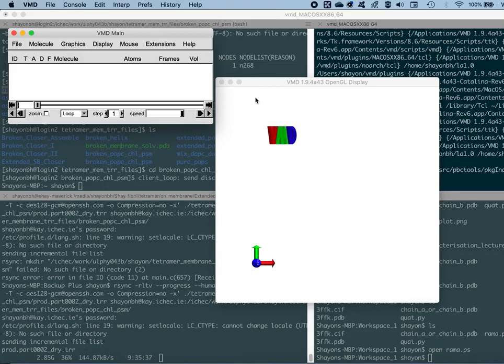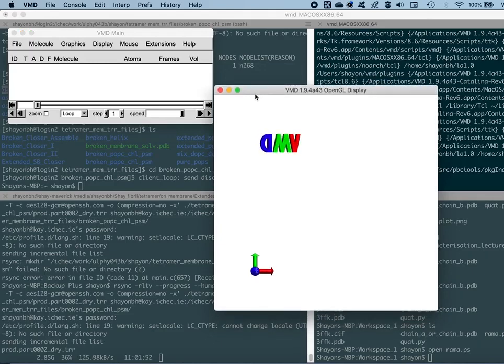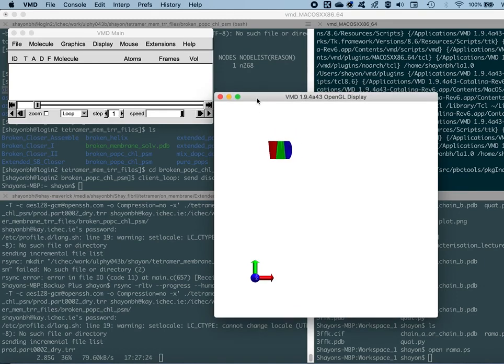So these temperature factors or B factors basically designate the movement of atoms, like the higher the temperature factor in terms of their numbers, the more the movement of atoms in that region. And this is usually a result of the electron density maps that you see. The fuzzy regions are actually high in temperature factor. So we'll see if we can predict the dynamics of the protein, well, without running a molecular dynamics simulation in reality, and just do a prediction of how much of a movement each of the atoms in residues might have just based on the temperature factor.